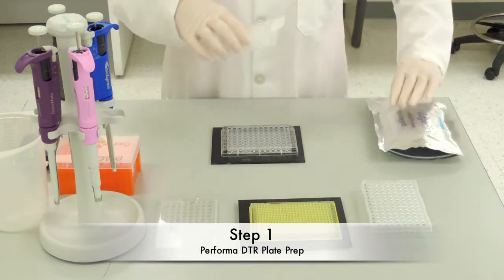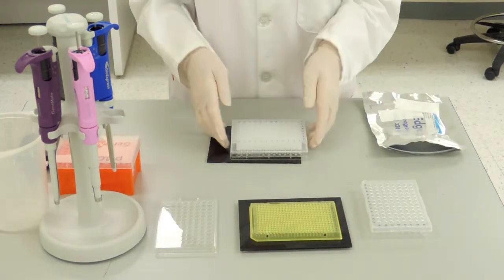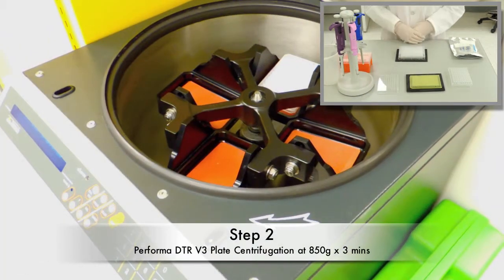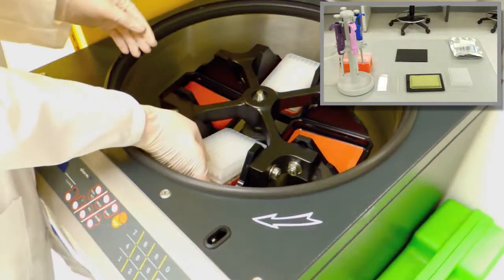The first step involves pulling the plate out of the foil pouch and removing the top and bottom plate sealers. The plate is then placed on top of the flat bottom waste plate and sent off for centrifugation at 850 Gs for 3 minutes.